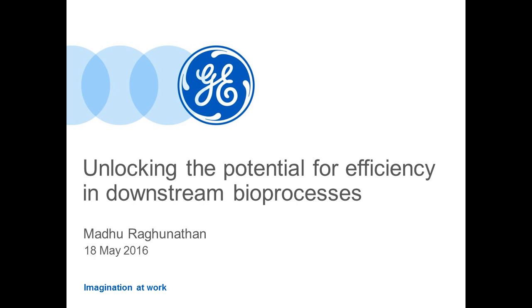Specifically for your question about ceramic resins, I would say it depends. Depending on the type of resin being packed, the axial compression methodology should help there. And as long as the intelligent packing method recipe is already there, or if it's not, it can be quickly developed and put in place, you can use that as a way of packing the specific resin that you're talking about.